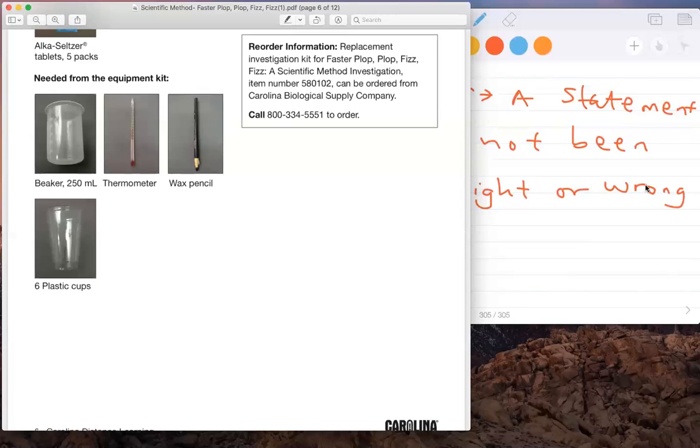If I look at the rate, they want you to split it into 2, and if you have a whole tablet, it might take twice as much time than if you had half. So use a half.